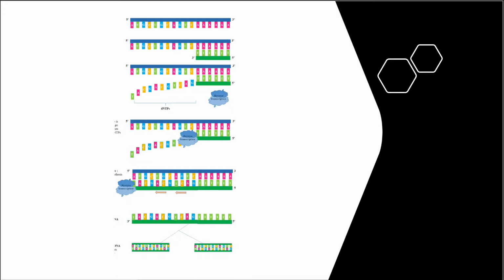The cDNA amplification step provides opportunities to further study the original RNA species, even when they are very limited in amount or abundance. The common applications of RT-PCR include detection of expressed genes, examination of transcript variants, generation of cDNA templates for cloning, and sequencing.